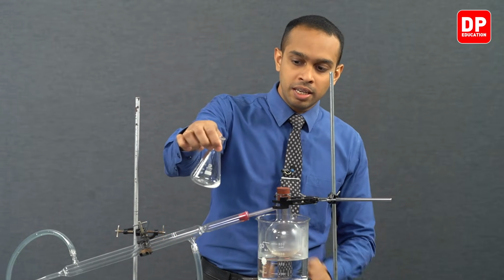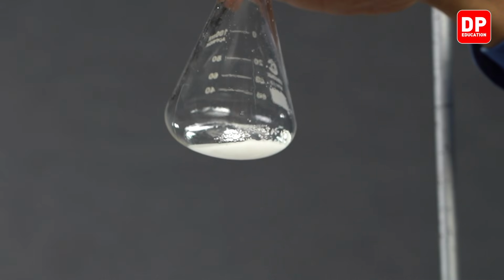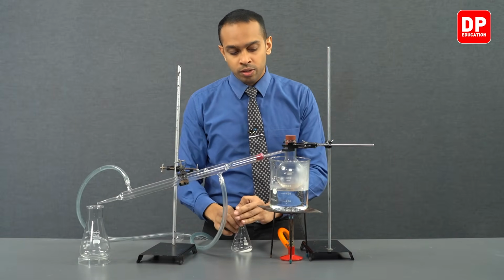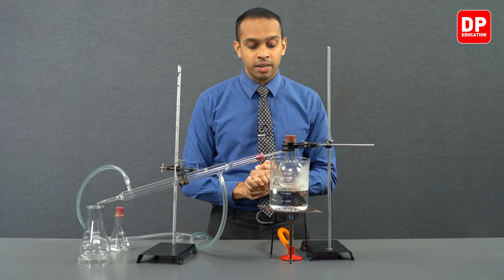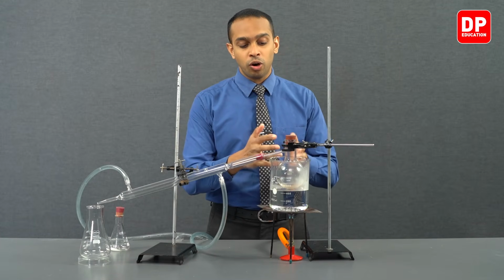Now students, you can see the sodium sulfate did not get transferred into our distilling flask. However, all of the diethyl ether got transferred into our distilling flask. So diethyl ether has dissolved essential oils in it.